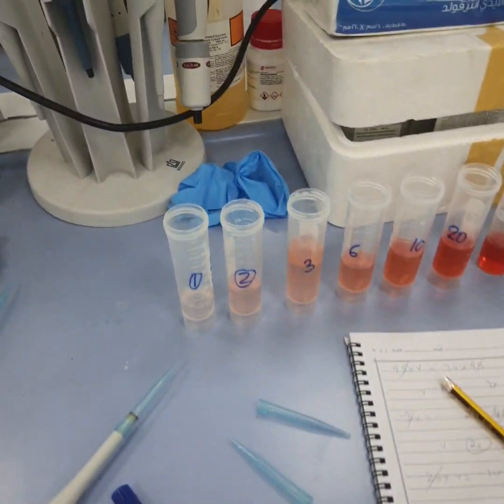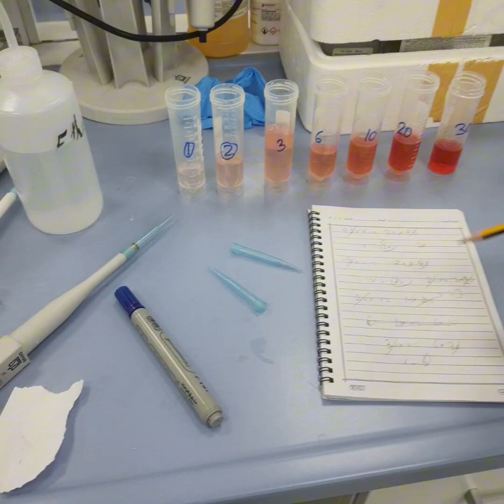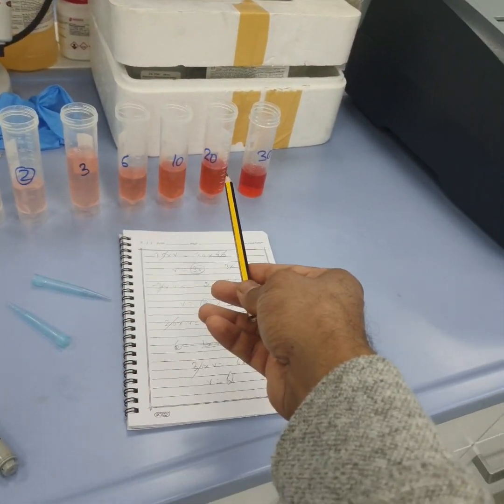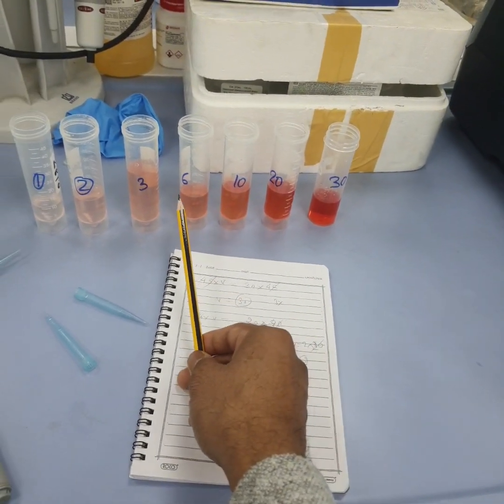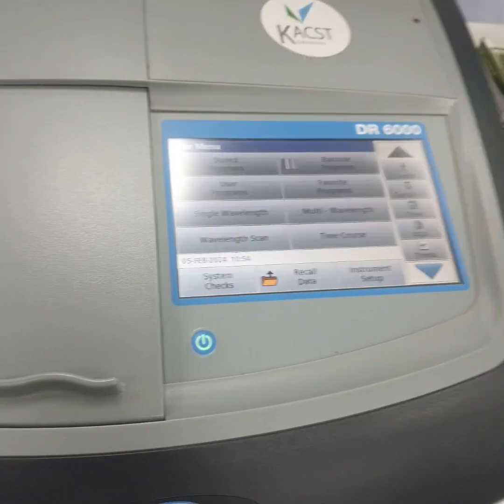Congo Red. Now this is our, what is this, students? It is our serial dilution. From 45 ppm we made lower stocks: 30 ppm of Congo Red, 20, 10, 6, 3, 2 and 1. Now you can come closer and see how we make the calibration.